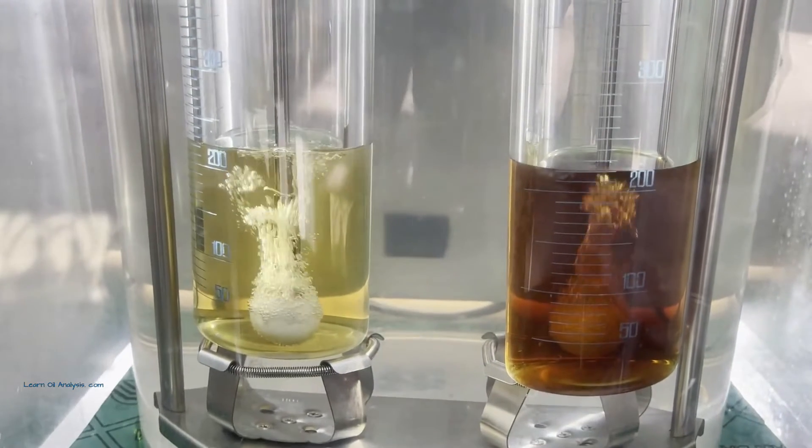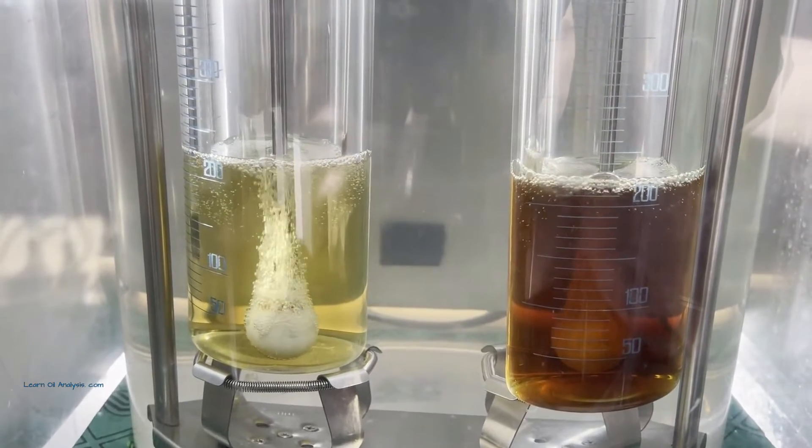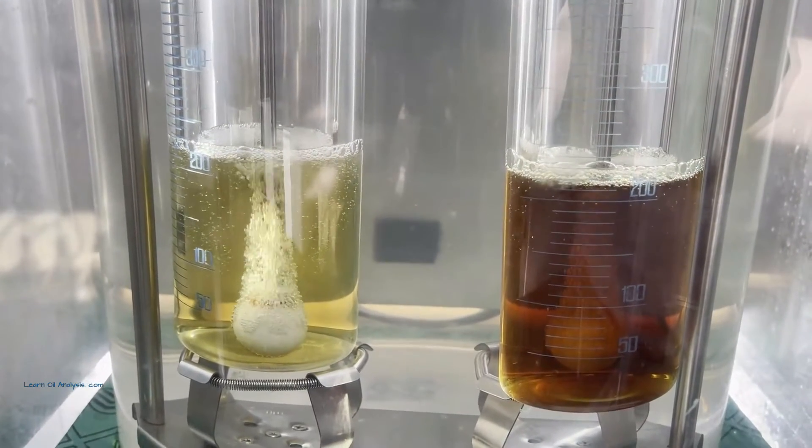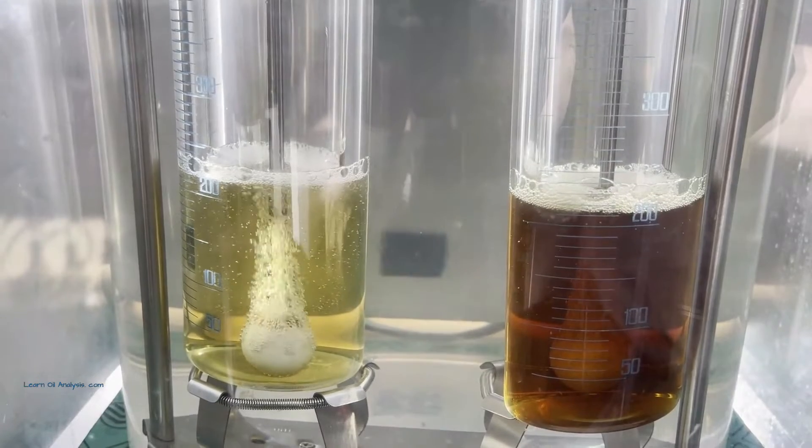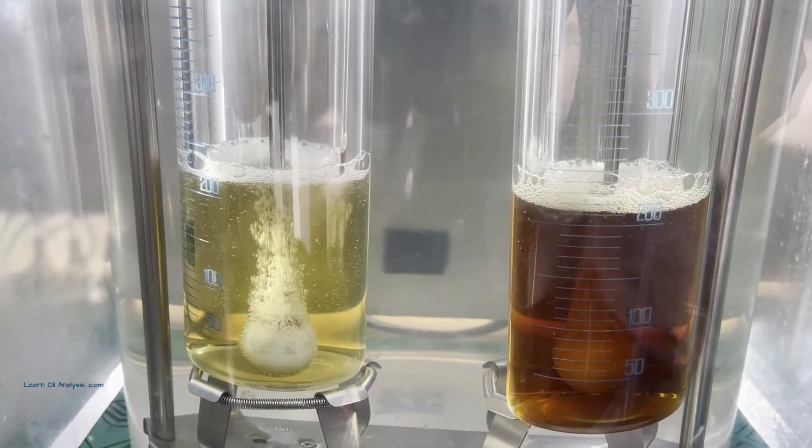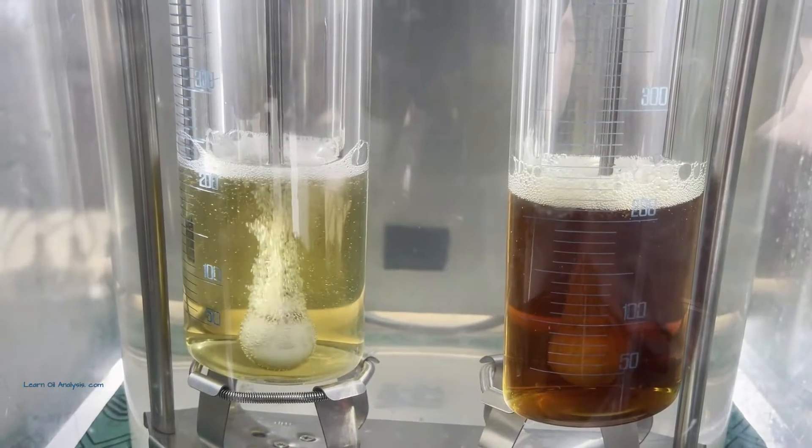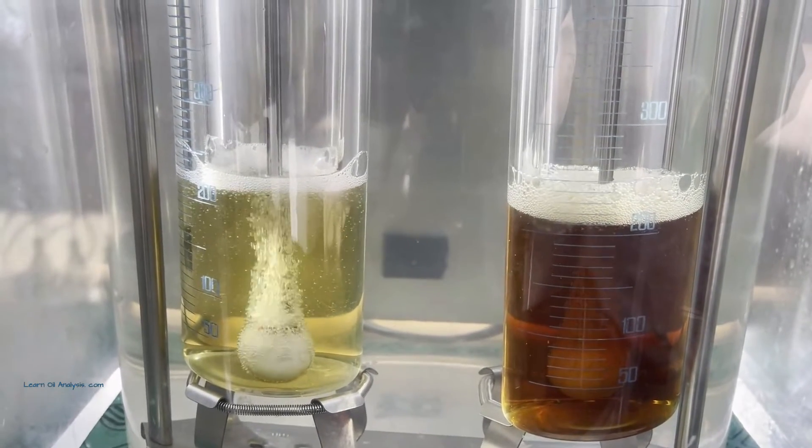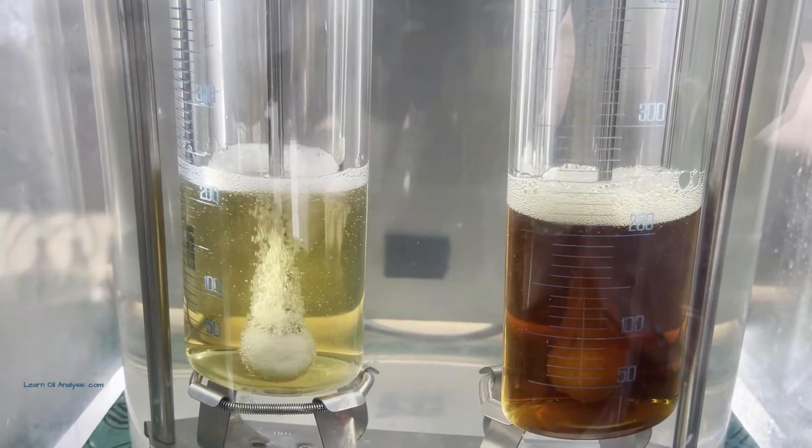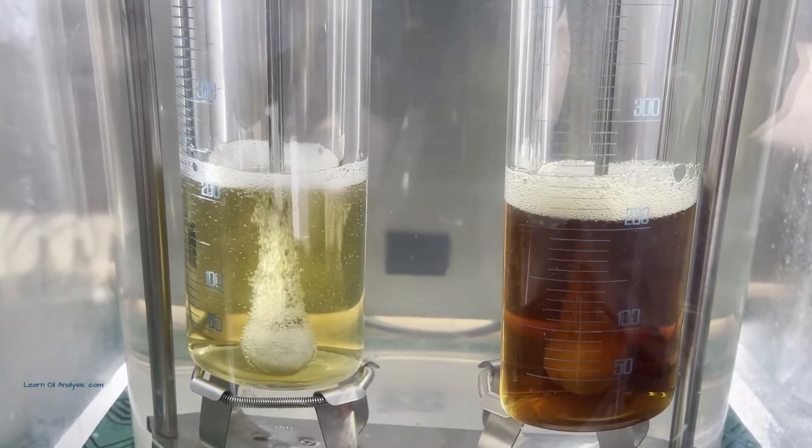Picture this, air is pumped through an oil sample using a special air stone, not too dissimilar to the ones in your aquarium. We then measure the foaming tendency and stability. The tendency is the amount the oil will foam when given a chance under heavy air entrainment conditions. Stability is how much foam stays at the end after removing the air source.